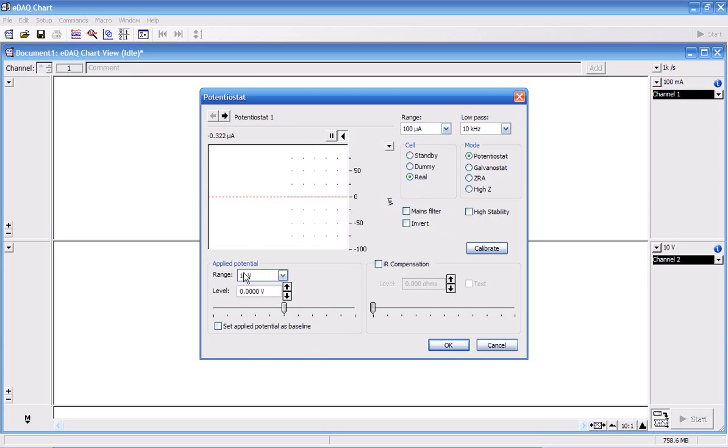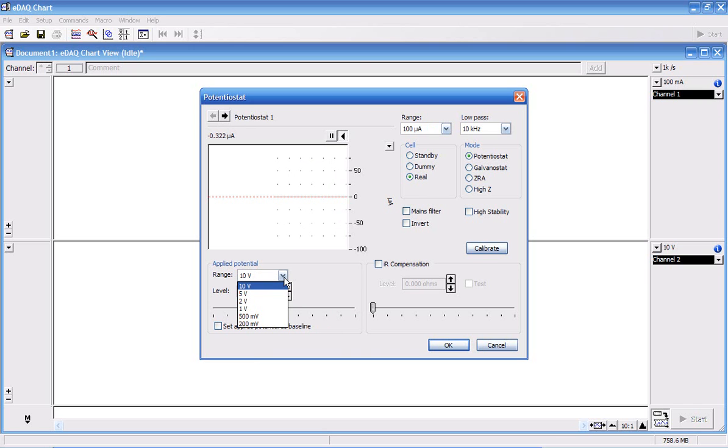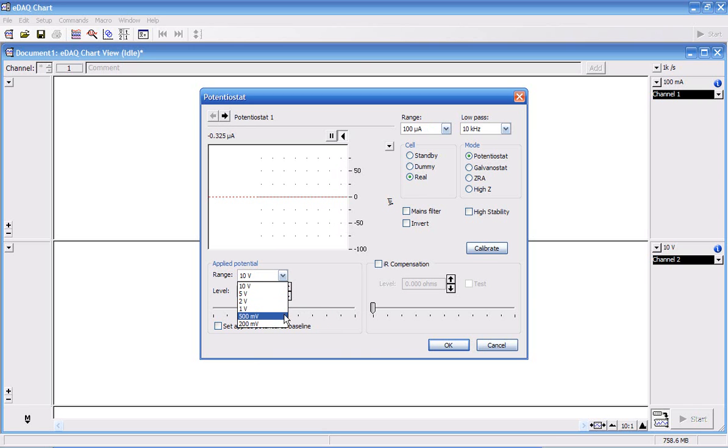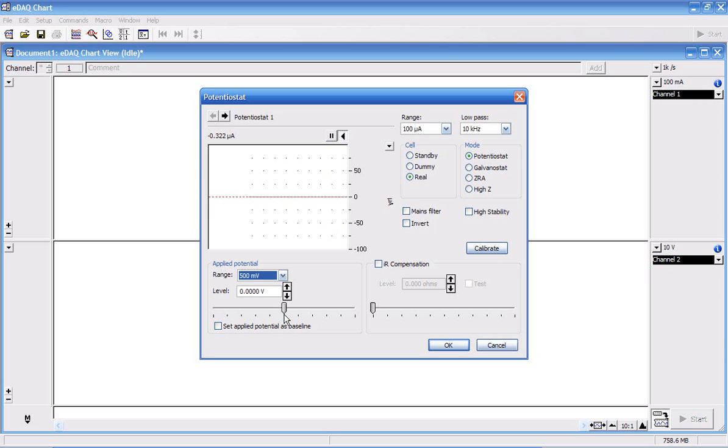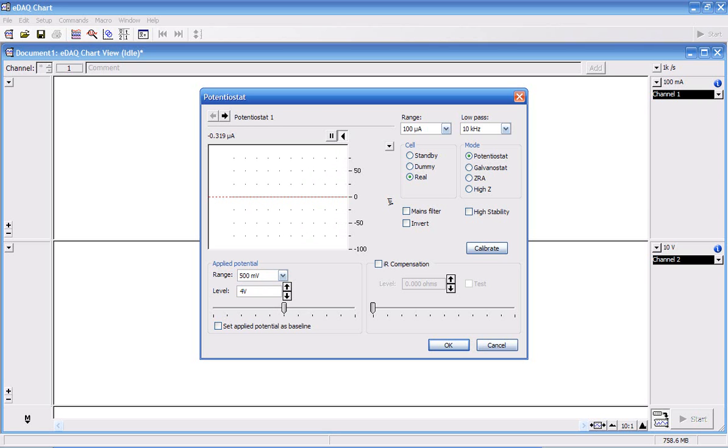Start by choosing the range. For this example, I'm going to choose 400 millivolts. So my range, I'm going to set to 500 millivolts. And in here, I'm going to type 400 millivolts.